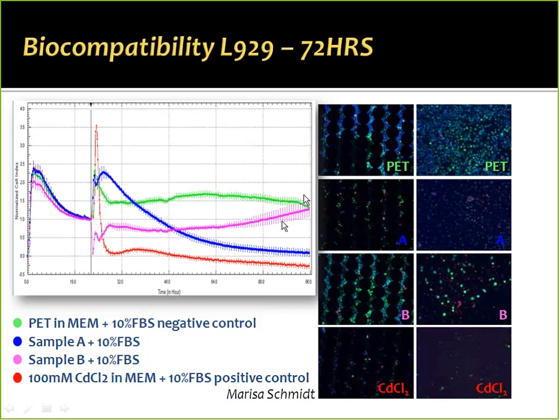But what we did do is we sent these samples out to the certified laboratory, and they came back with the result that we saw with the xCELLigence, which is at 72 hours, this one in fuchsia was scored as not cytotoxic. Whereas by eye, we really struggled with scoring this result here. And this was consistent from many times that we sent out our samples to Aptec.